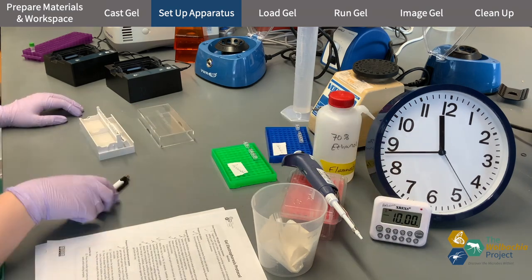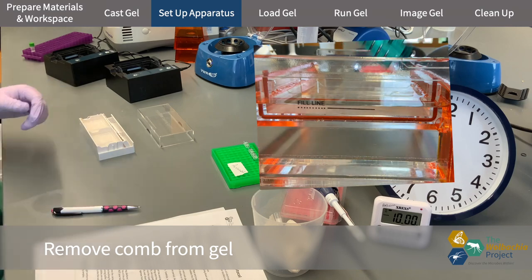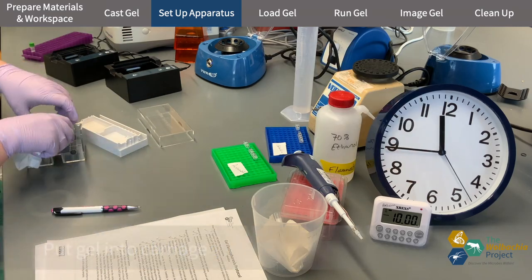Once your gel is firm to the touch, gently remove the comb from the gel. Unless you're careful, there's a chance you could tear the gel when you remove the comb. Then put the gel into the buffer tank.